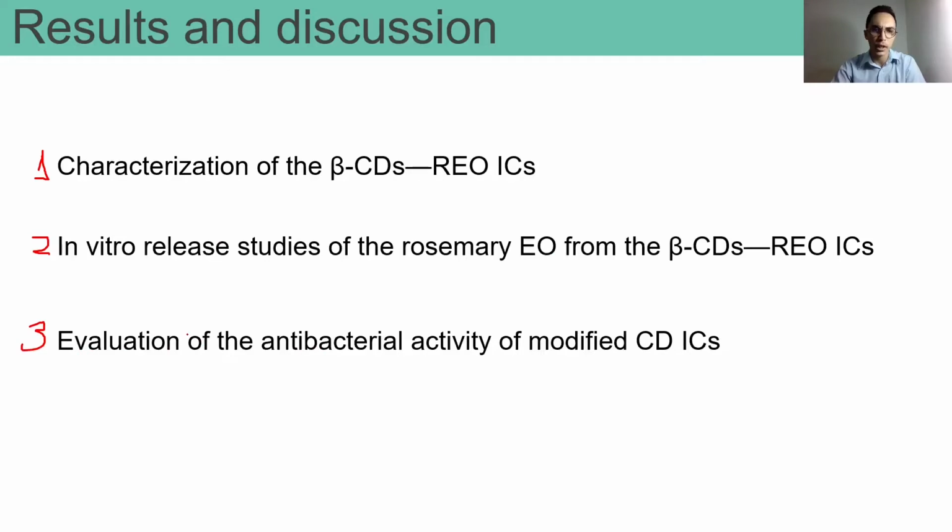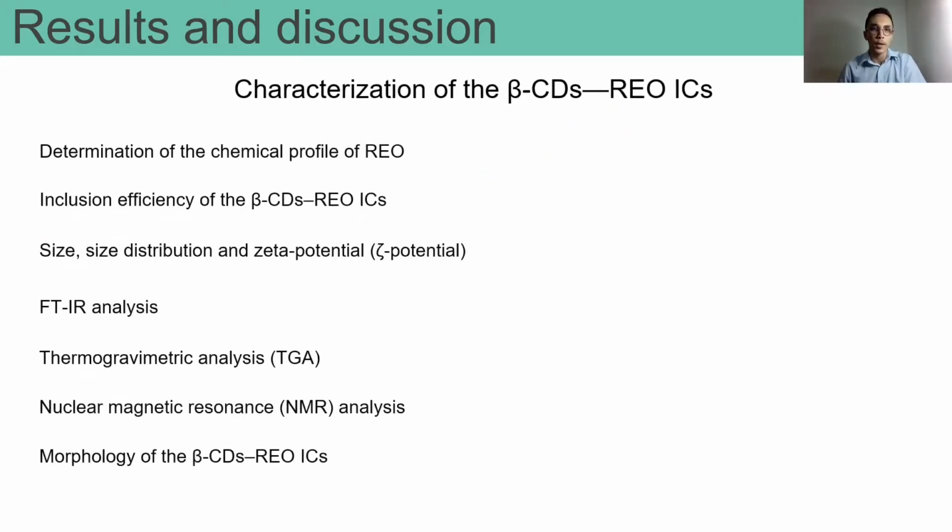We're going to talk about the evaluation of antibacterial activity for modified cyclodextrin inclusion complex. And first, the characterization of beta-cyclodextrin and rosemary essential oil inclusion complex. And let's go. For a better understanding of the characterization, we're going to talk about some topics that I divided into seven.